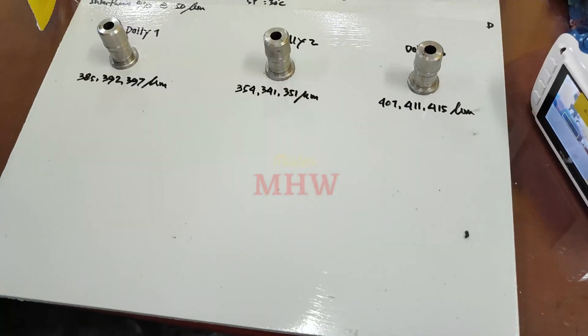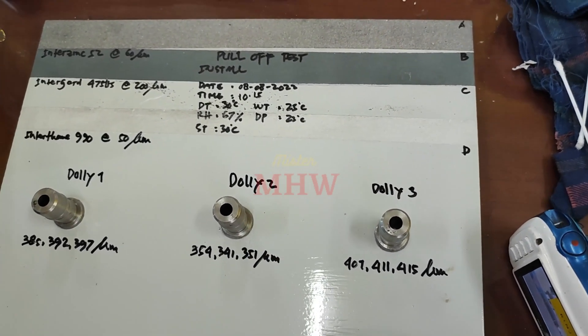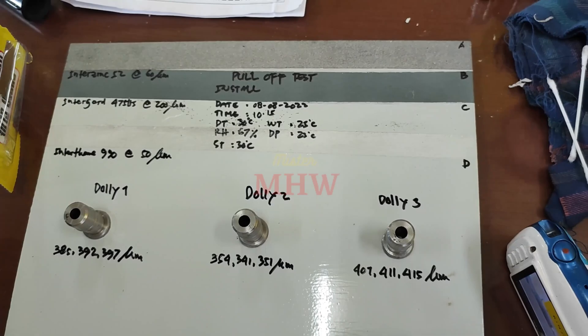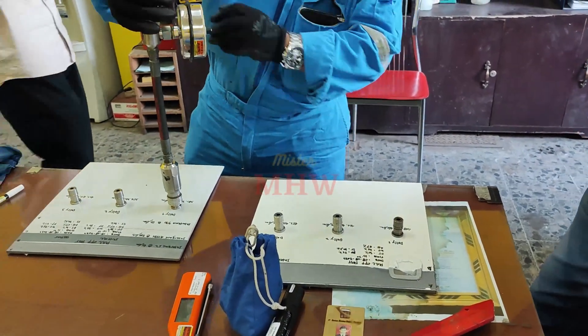When testing coating adhesion using a pull-off adhesion gauge, once a properly prepared dolly has been glued to the prepared coating and the glue has fully cured, you are ready to perform the pull-off test.